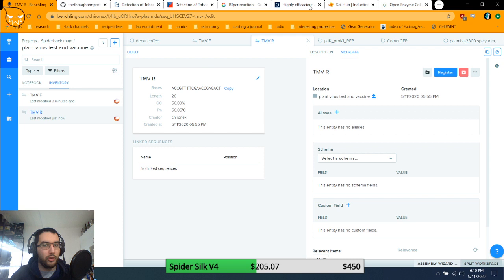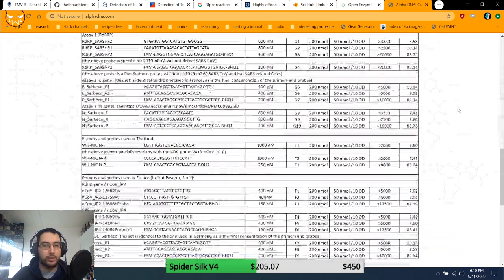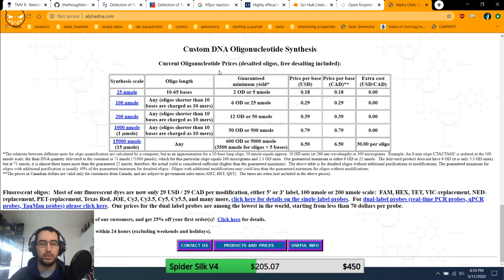So instead of having to go to my main gene synthesis company, which is slow and could take them months, this company delivers DNA in 2 days. I can actually show you. So this is the company that I use. These guys are fantastic. They deliver in 2 days. They can do up to 65 bases. So we have 65 letters to work with, which is a little small, but it's doable.